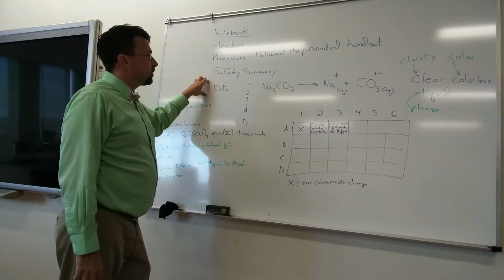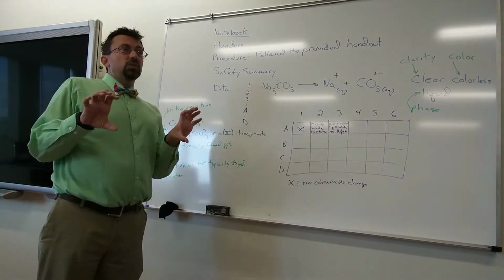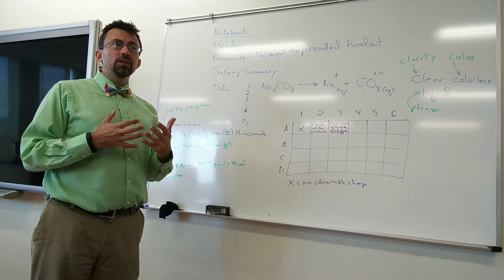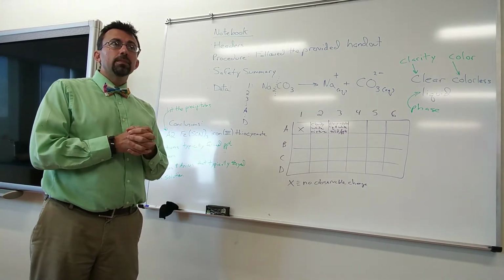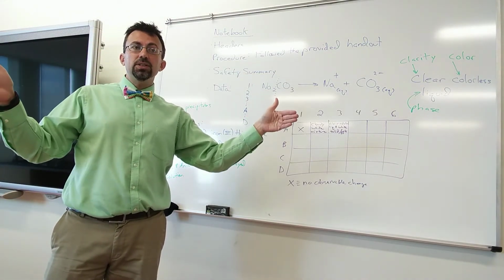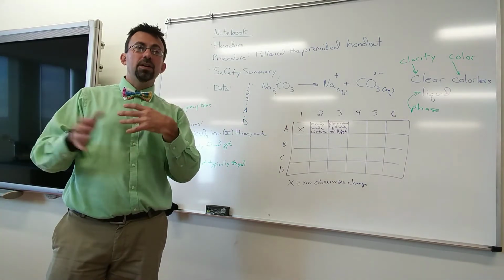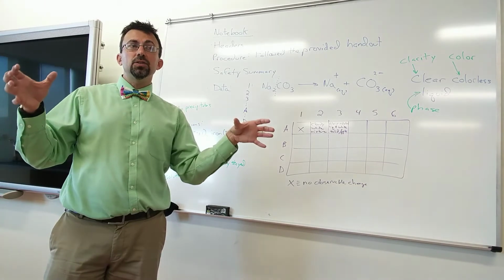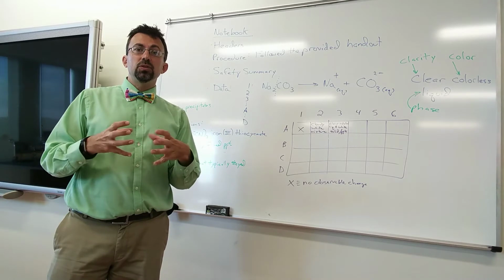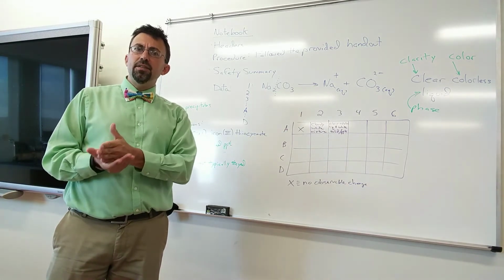And then for the data today, I'm going to change this up a little bit from what the lab asked you about. It's saying to mix solutions and see if there's a reaction, and then describe what occurs. But you can't describe a procedure unless you describe the before and the after. Otherwise, you don't know if something happened. If you take a blue solution and it stays blue, nothing happened. But if you had a clear solution, pour it together and it turns blue, something happened. So you can't just say blue solution reaction or blue solution no reaction. We need to know where we came from to see if anything changed.